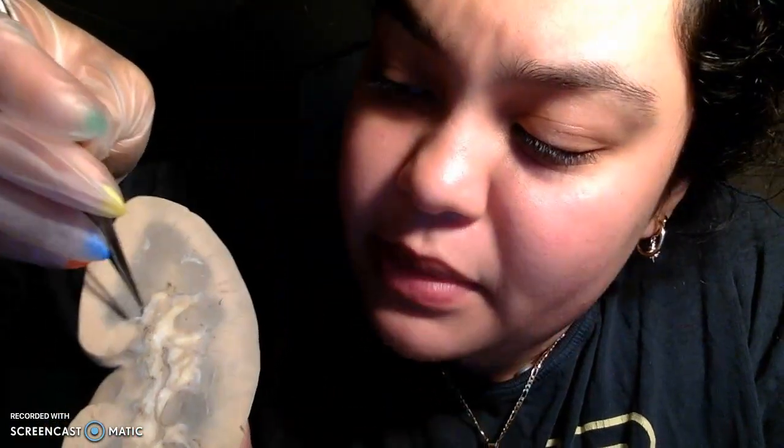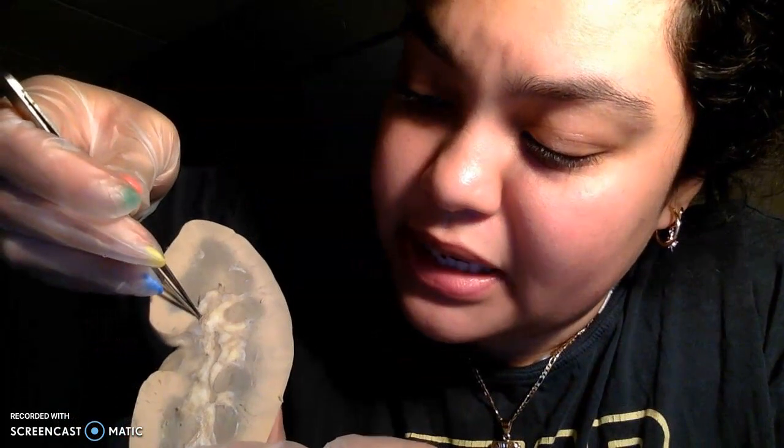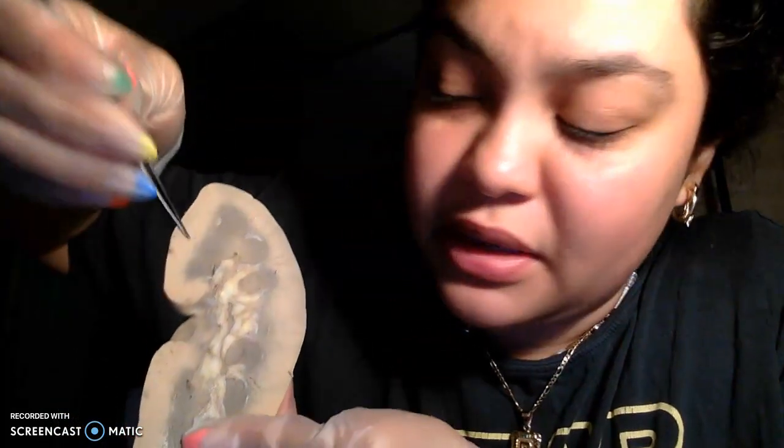The renal sinus is a cavity, kind of like a hole in the kidney. I had some trouble finding it, but if you look right here where I'm pointing, it's this part right here. You can kind of see that it's like a hole, but that is the renal sinus, and there's some throughout the kidney, but that is the one I found.